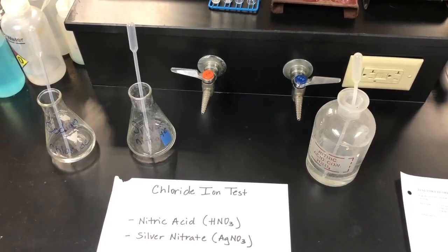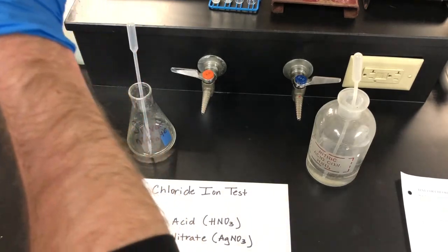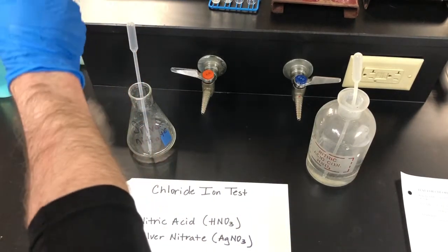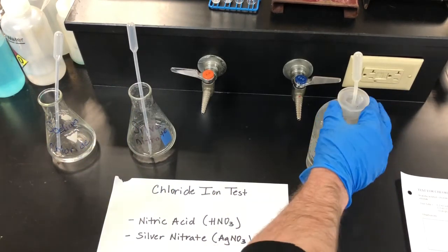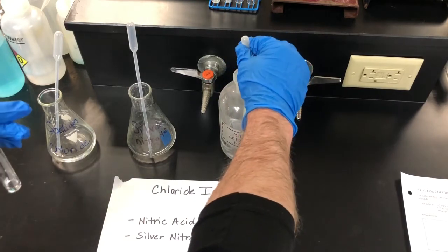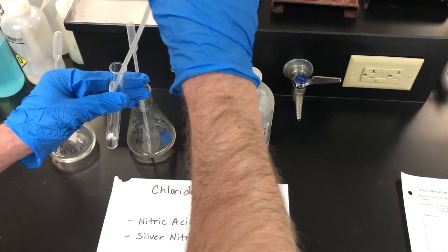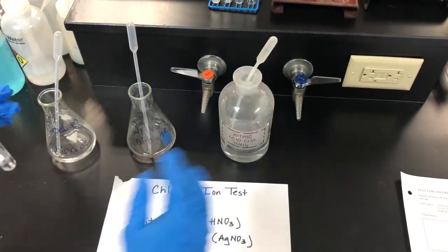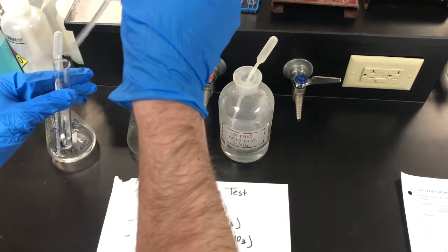Okay guys, so this is going to be the chloride ion test. So what we're going to do is we're going to take a known solution that contains chloride. So we're going to take sodium chloride and we're going to use a healthy squirt. Whenever it says 1 to 2 milliliters, we're just going to do a healthy squirt. We're going to put it in there. And it says we're going to need 1 to 2 milliliters of nitric acid. So we have nitric acid right here. I'm going to put a little squirt. And we're going to put 10 drops of silver nitrate. So we're going to pull a squirt of silver nitrate to see what it does.